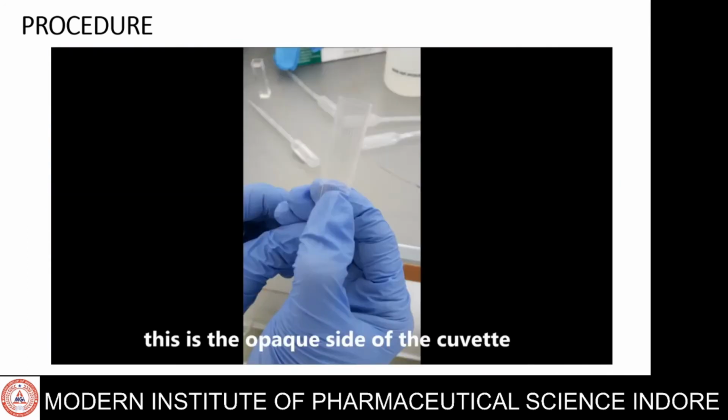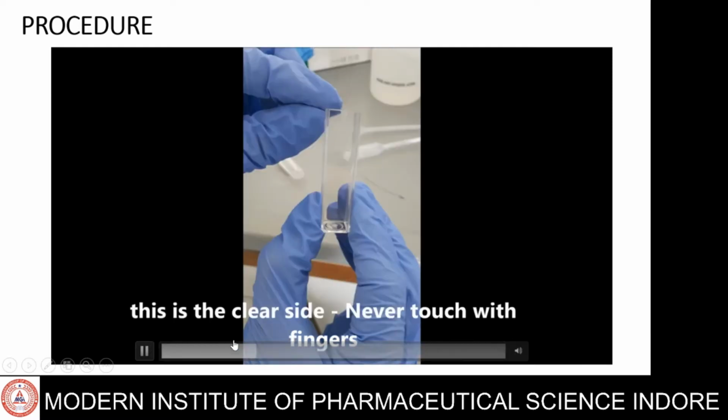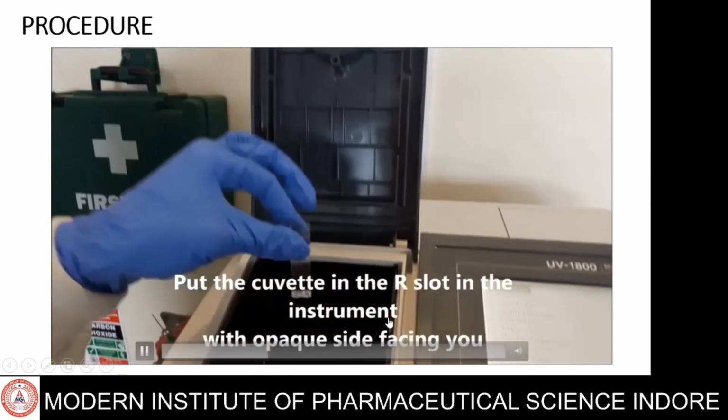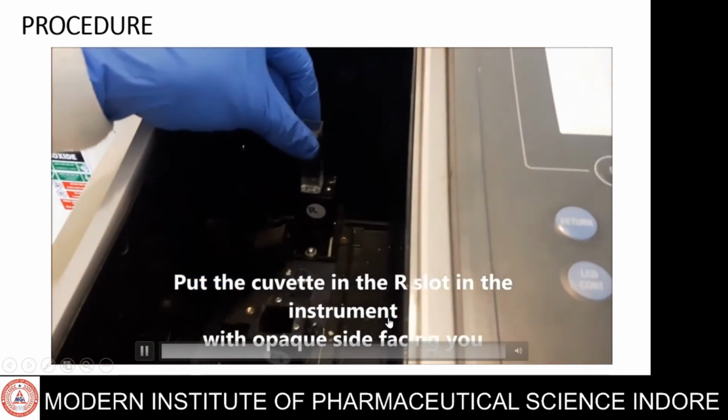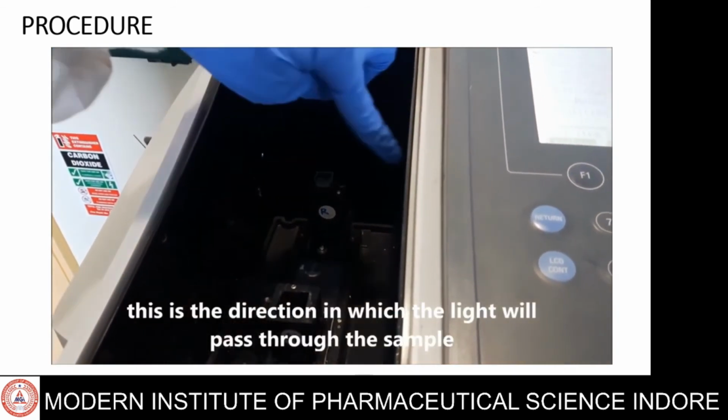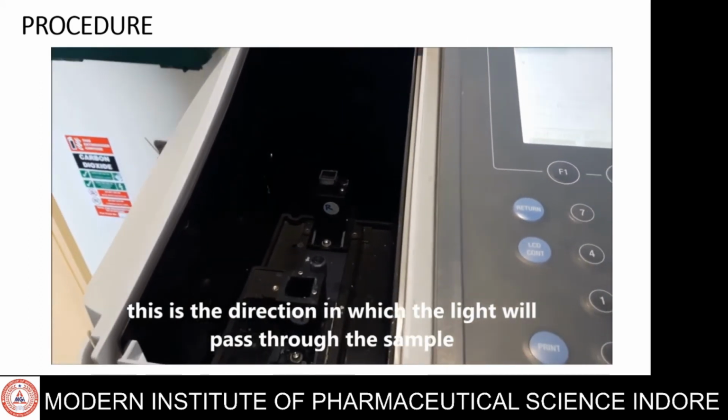Now we have to keep the cuvette in the UV visible spectrophotometer, but we have to remember something. This is the clear side, never touch it with fingers. We have to touch only the opaque side of the cuvette. Put the cuvette in the R slot in the instrument with the opaque side facing you. This is the reference cuvette. This is the direction in which the light will pass through the sample.